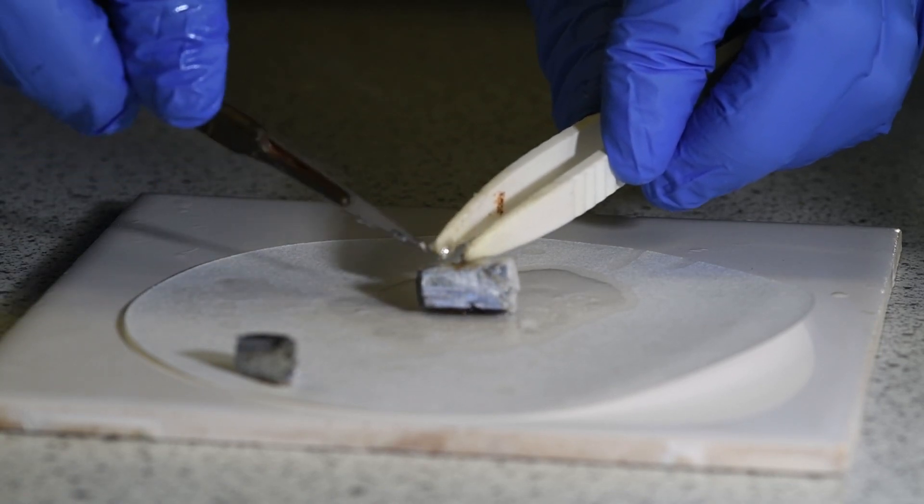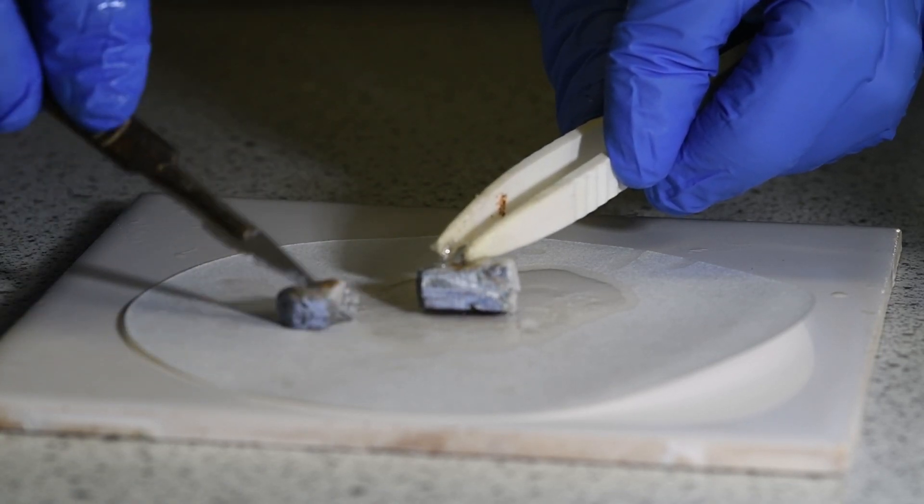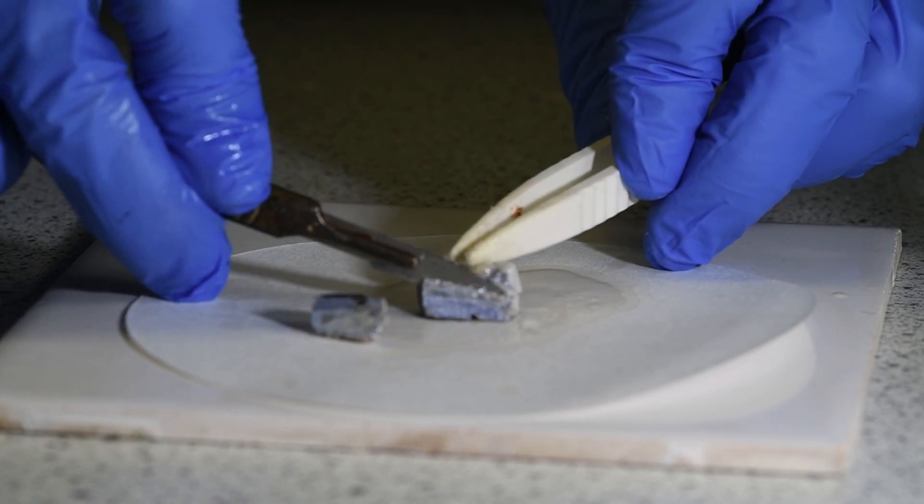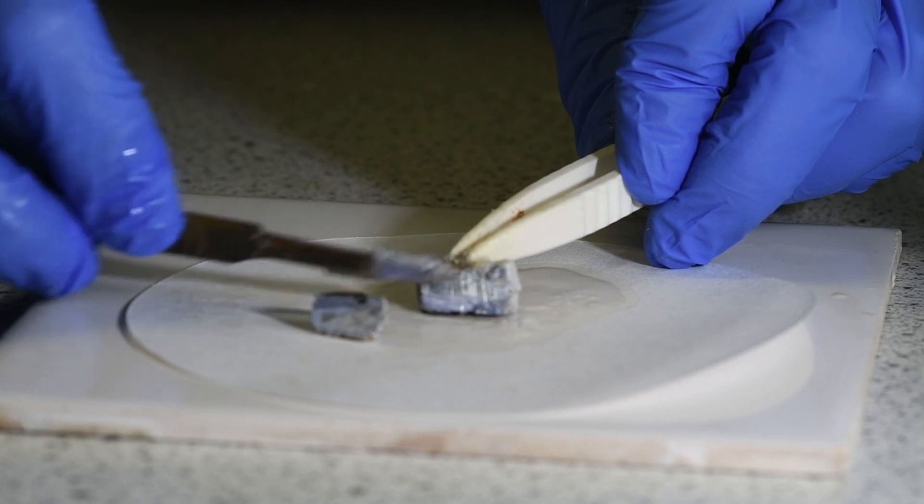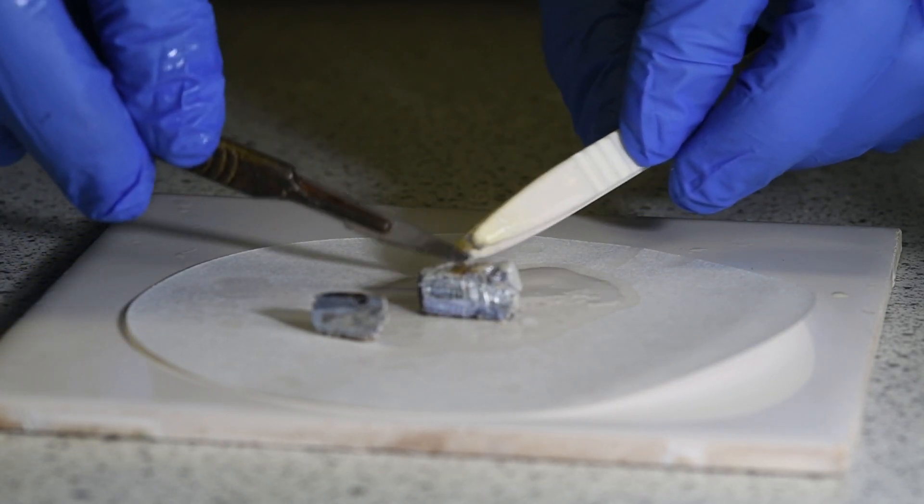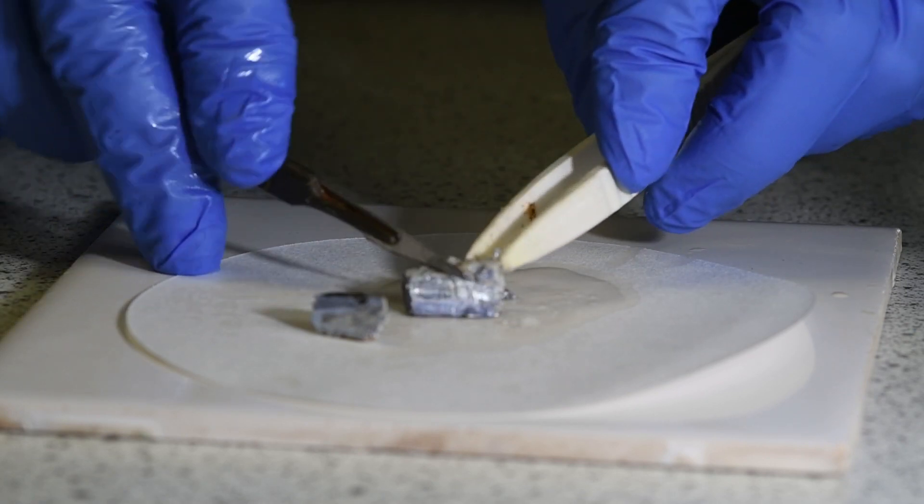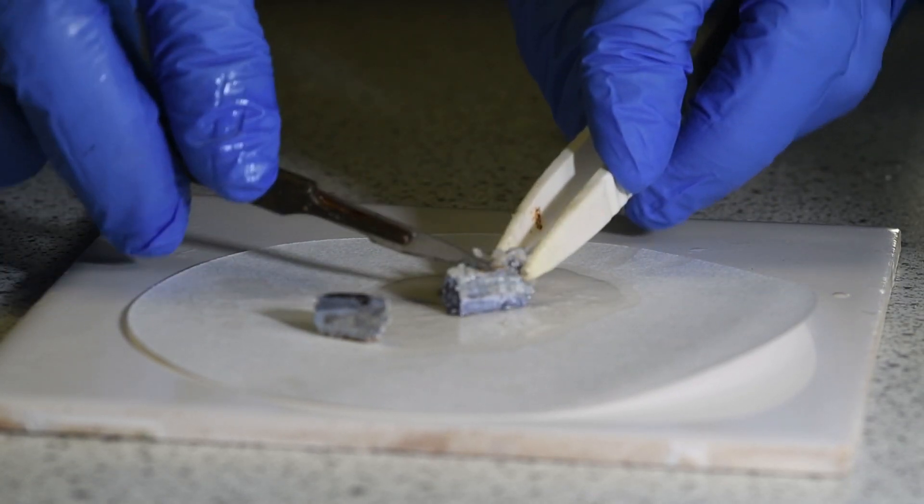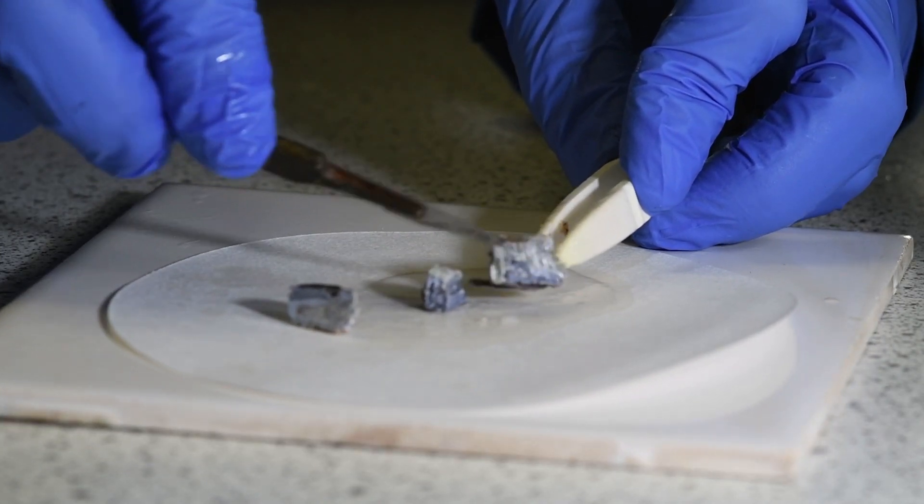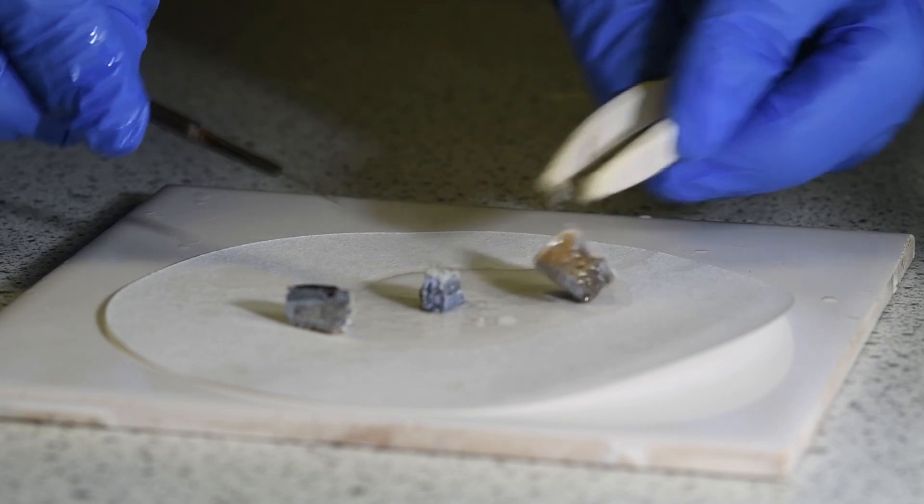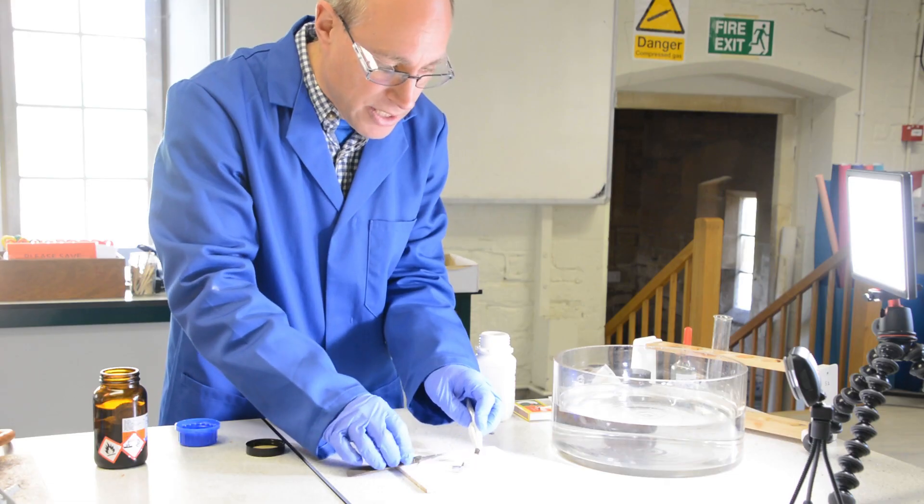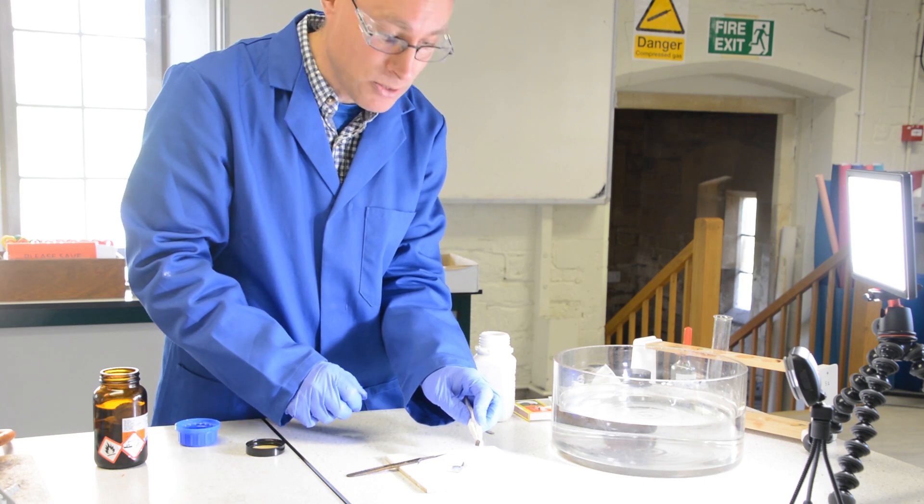And again, you get a shiny surface where it's cut. But that shiny surface very quickly tarnishes to go cloudy as the potassium reacts with oxygen in the air to produce potassium oxide. So very, very quickly that cut surface tarnishing there. So that's the alkali metals with air.